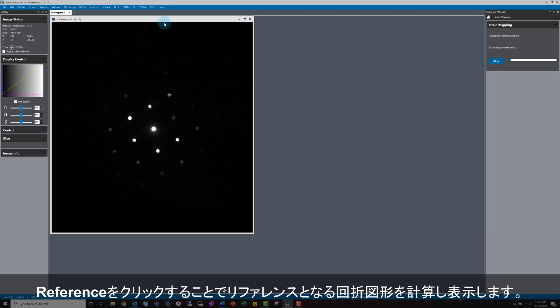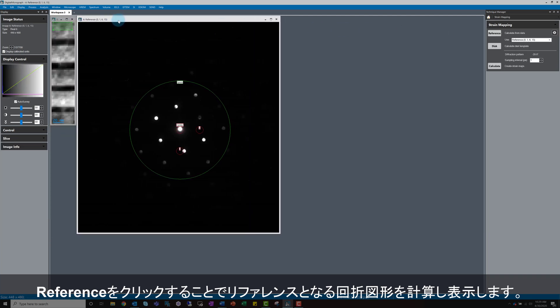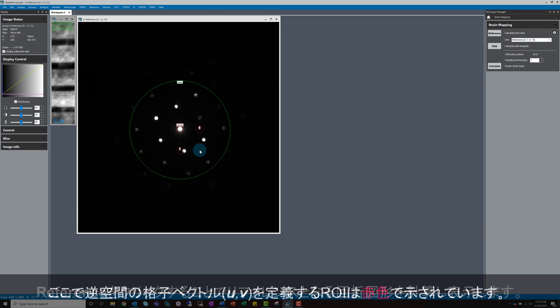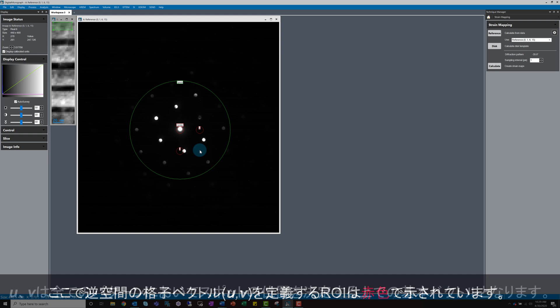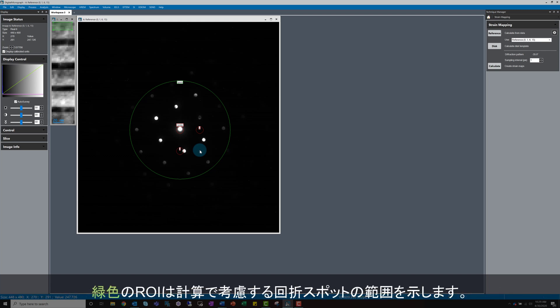Once calculated, the software will display the reference diffraction image. This image contains ROIs, shown in red, that define the reciprocal lattice vectors U and V. These will be used as the base vectors to find spot positions in all the patterns. A third circular green ROI defines the subset of diffraction spots that we want to include in the calculation.